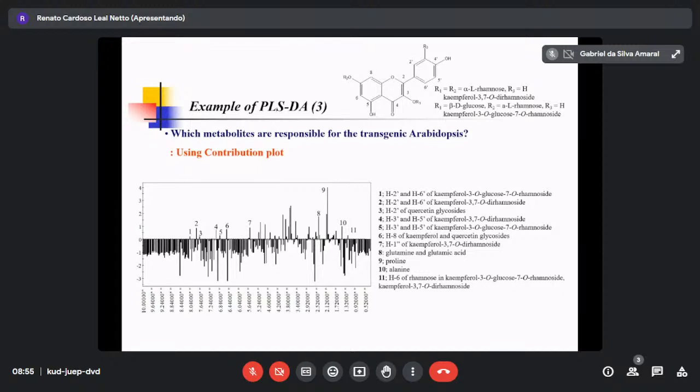The second step is, if you change by the reduced principal component 1, you can see which original value influences PC1. You can measure the angle, right? If this angle is 90 degrees, the original value at 90 degrees and PC1 have no correlation, nothing. But if it's 0 degrees, only height is influenced in this case.